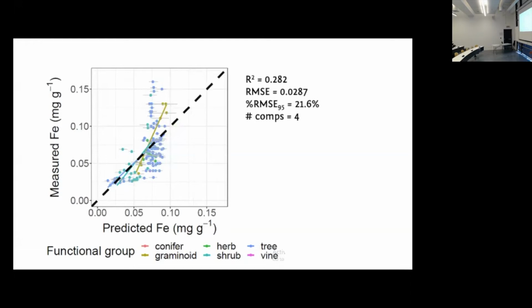The only way that we probably could sense a nutrient or an element like iron is if it becomes deficient and then has symptoms, or if it generally co-varies strongly with other things. Otherwise, we wouldn't really expect to be able to estimate iron content.